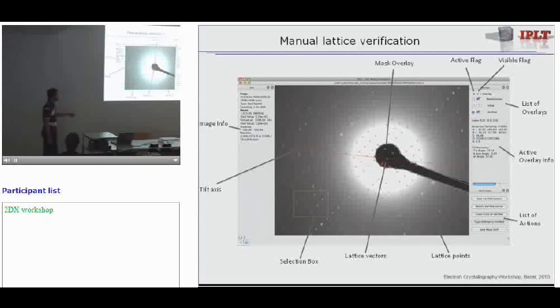But that's also a very good indication that you have the tilt axis for the tilted images more or less at the same position. For untilted images, it's basically random because there you often have a very low tilt of 1-2 degrees, and then the tilt axis can be anything. So that's one of the major things to look out for.